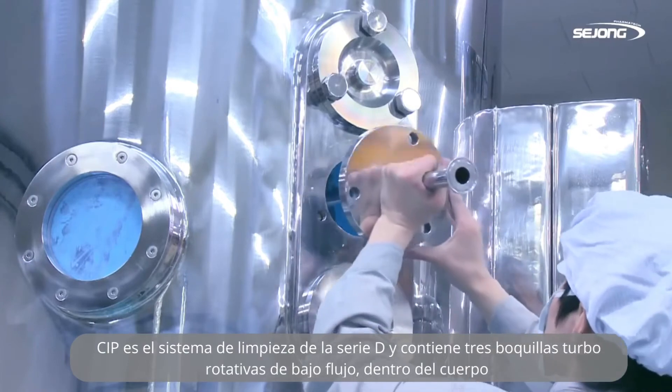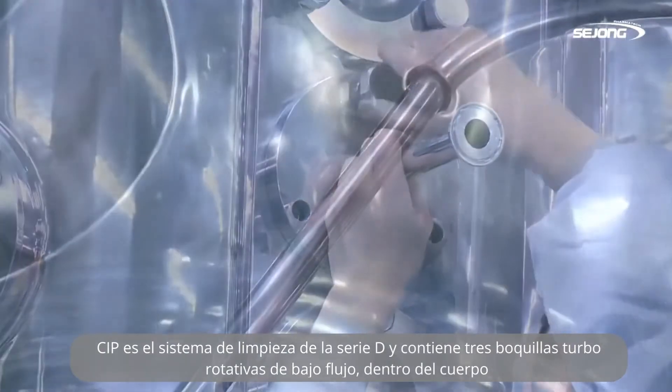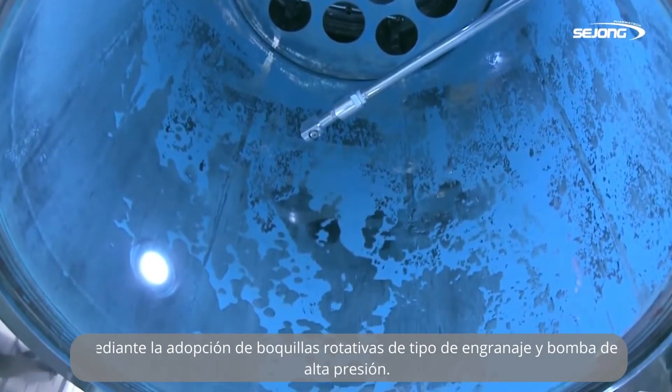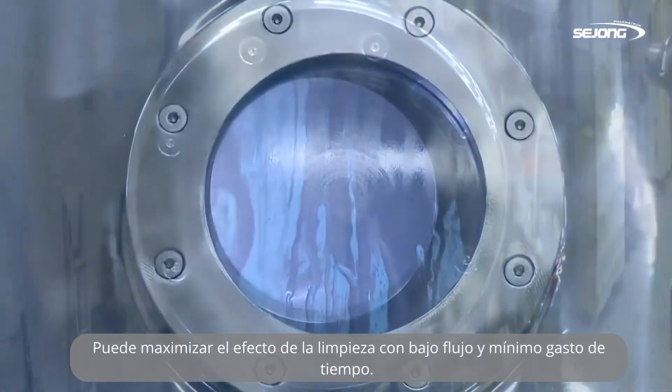CIP is the cleaning system of D-Series, and it contains three low-flow rotary turbo nozzles inside the body. By adopting a rotary nozzle and high-pressure pump, it can maximize the effect of cleaning with low flow and minimum expenditure of time.